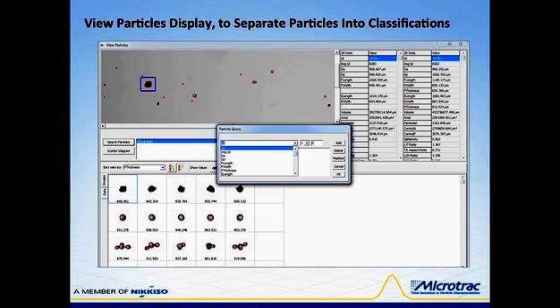In this display, we see the top row of images as multiple orientations of one sand particle, for example. In the second, a row of images of one good glass bead, and finally, one row of randomly oriented images of one bad glass bead, which turns out to be several beads fused together.